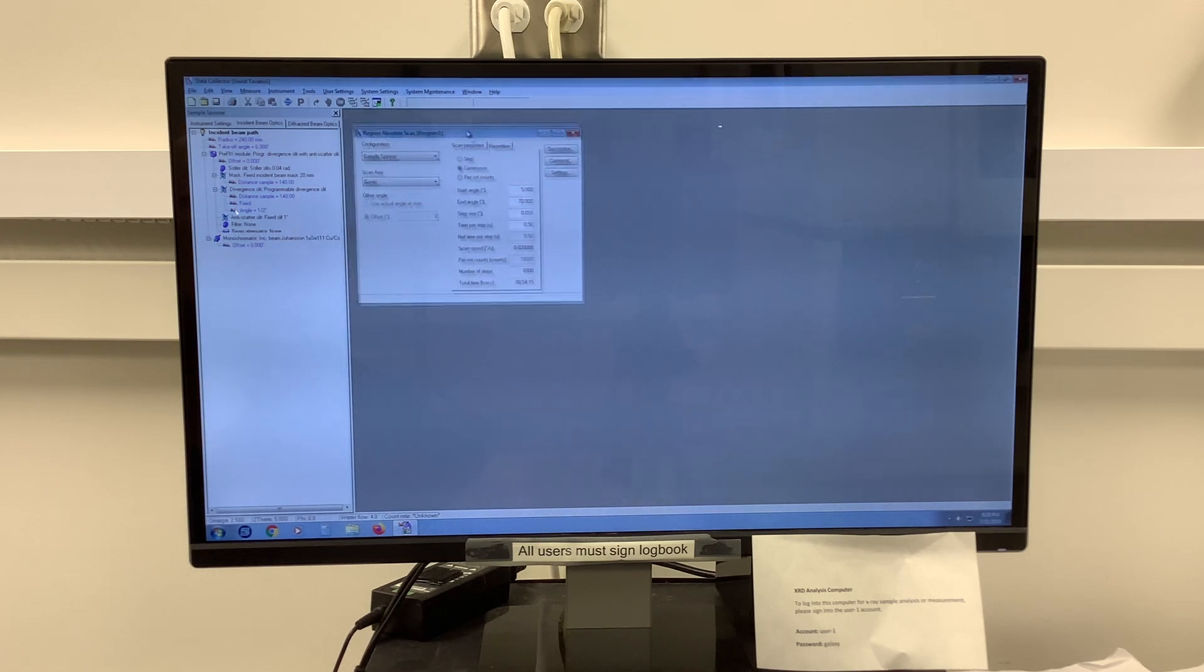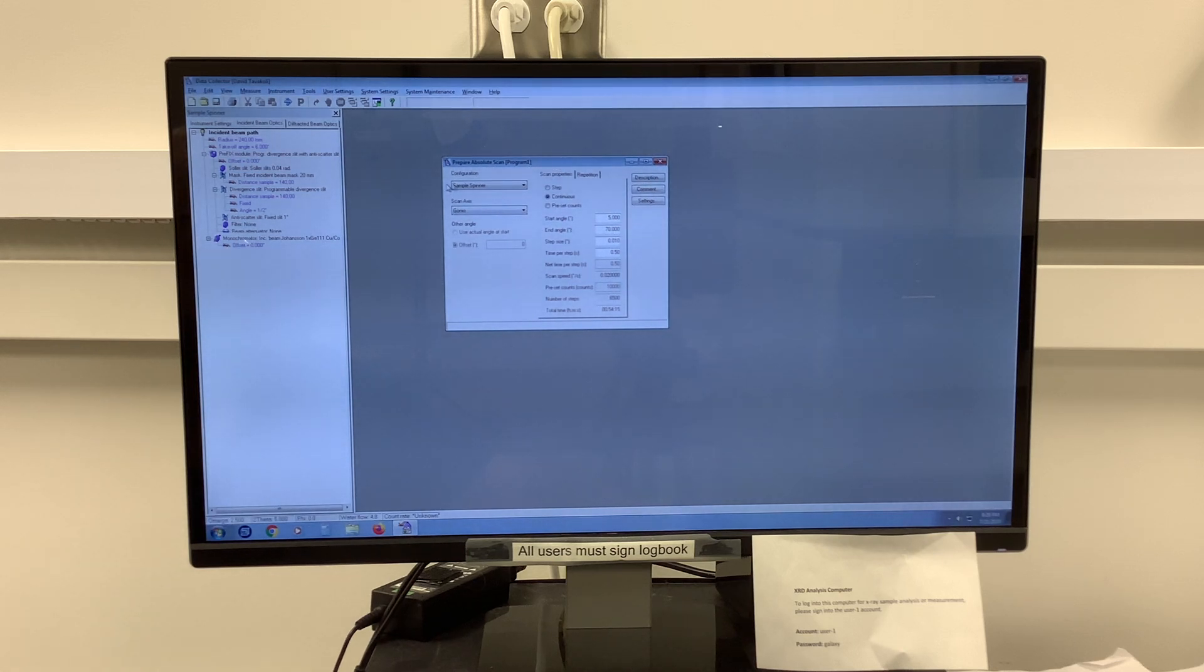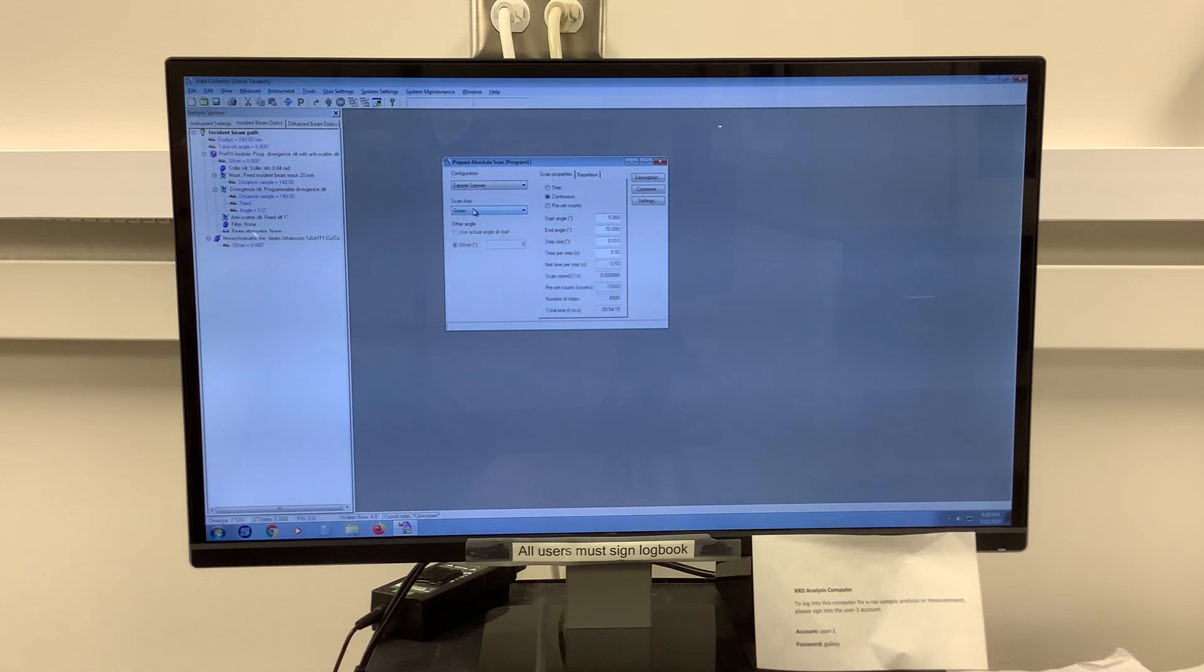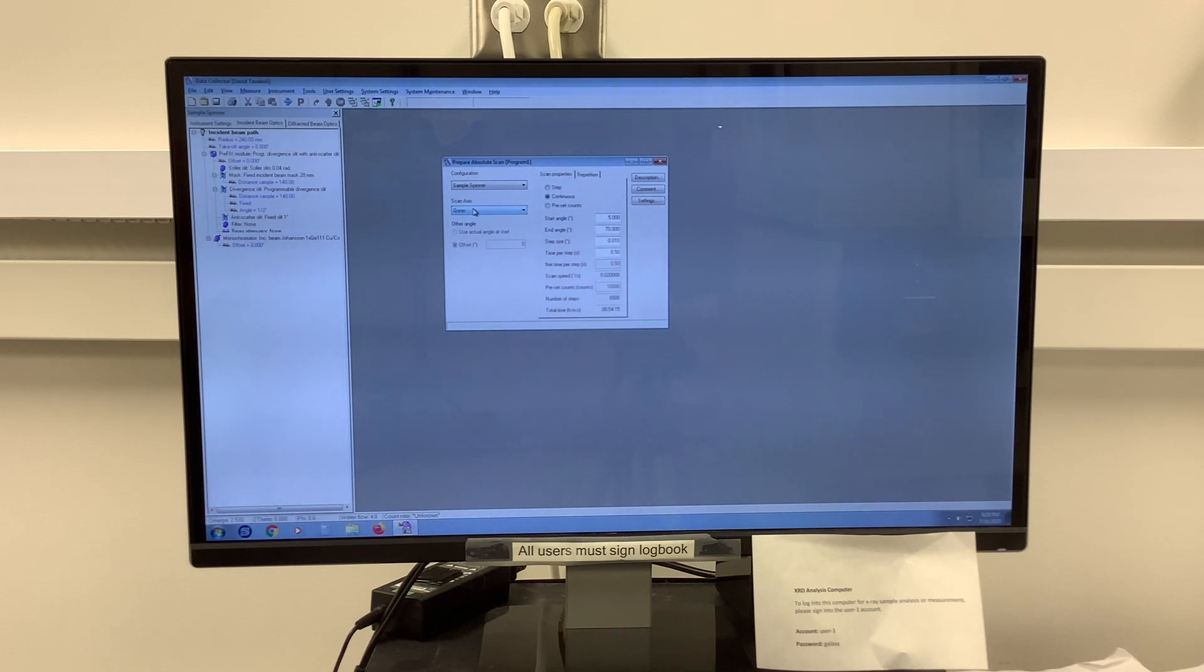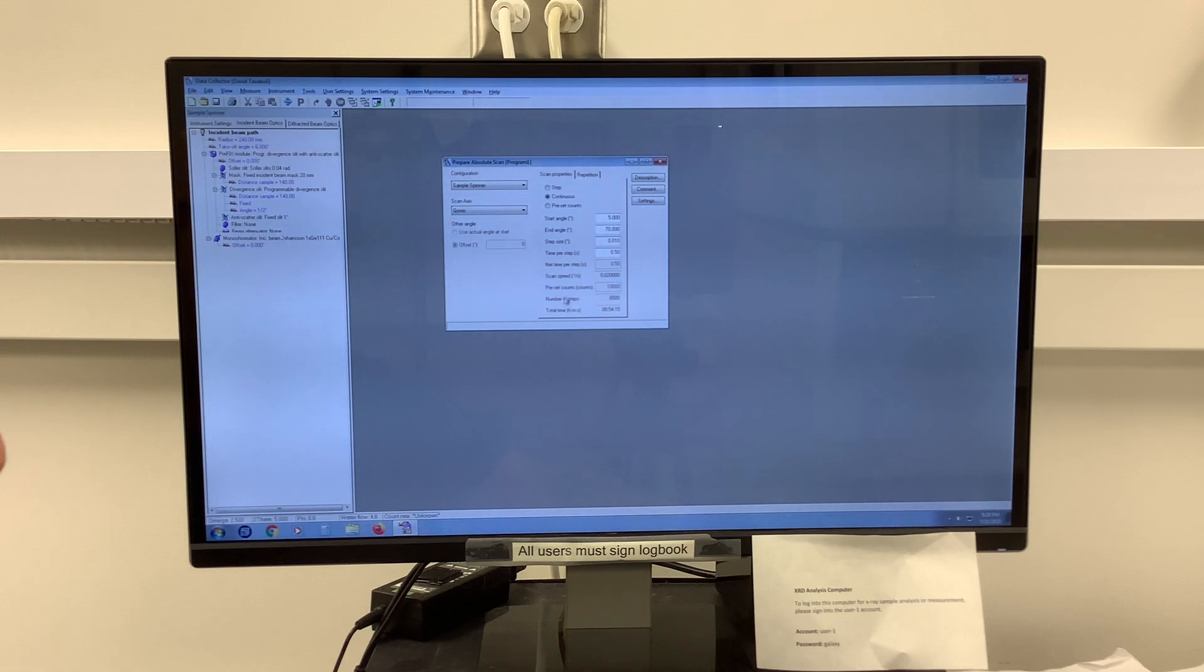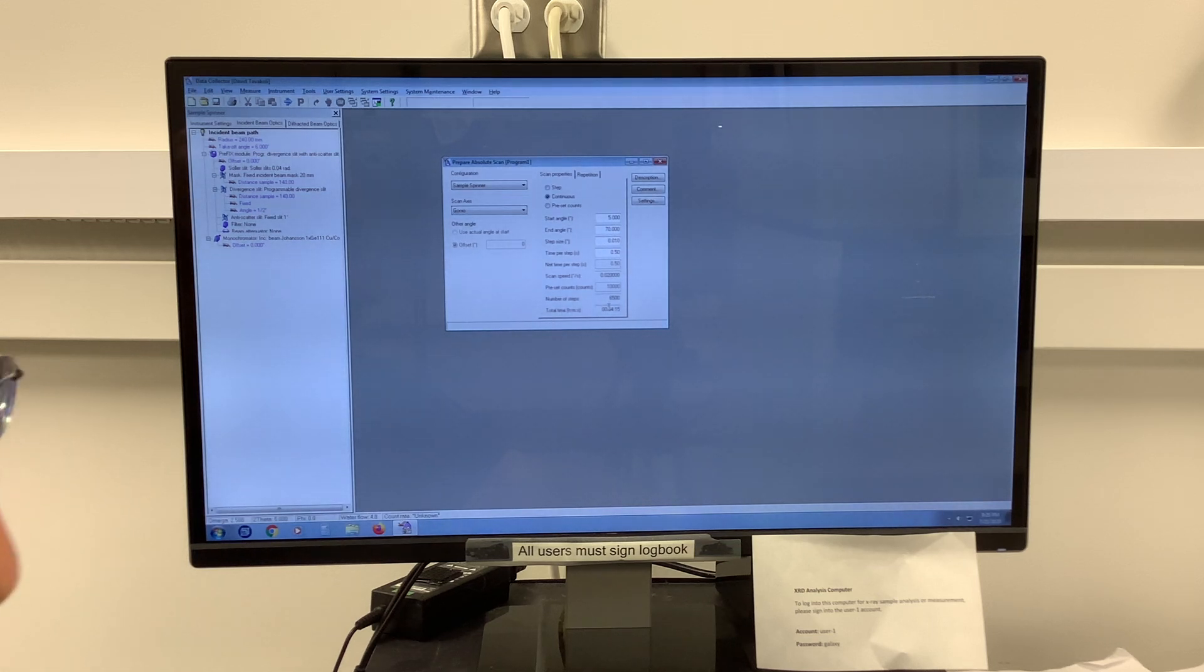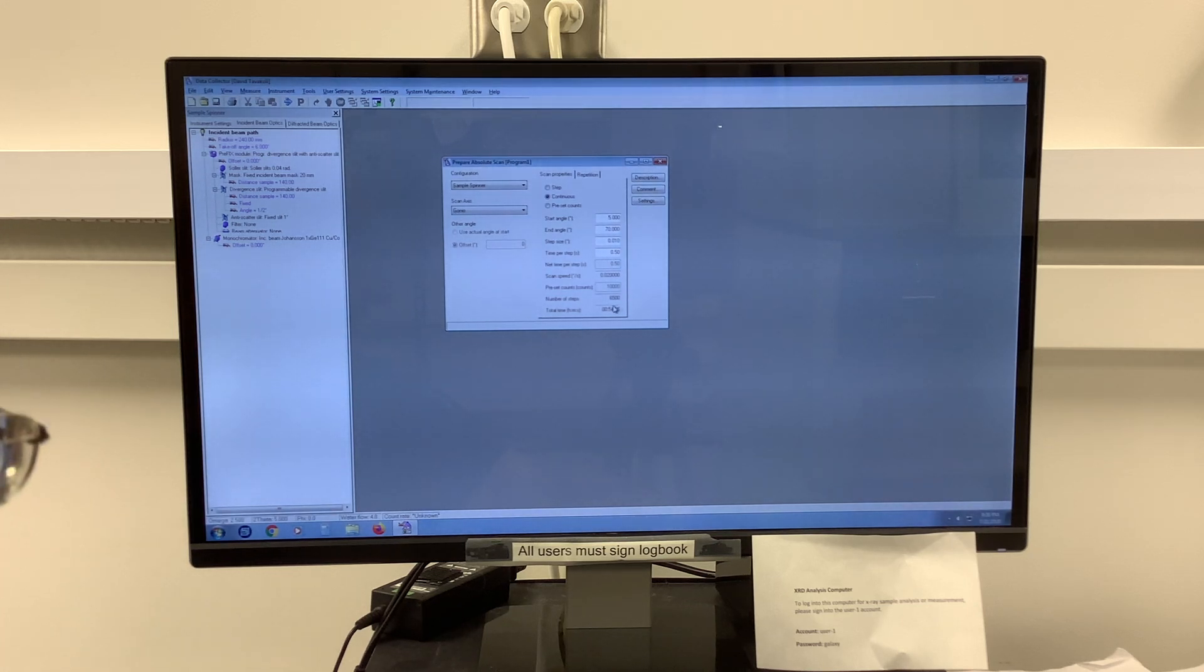Now in this menu, we notice a few things. Because you're already connected to our sample spinner, it's selected by default on top. Our scan axis is always going to be a gonio scan when we're doing bulk measurements. Now there are a few parameters we want to change here. We notice our total time right now by default is 54 minutes, and there are five parameters that control that total time.